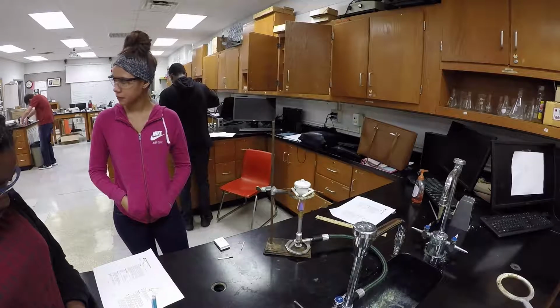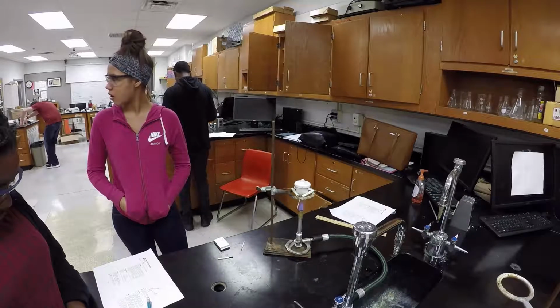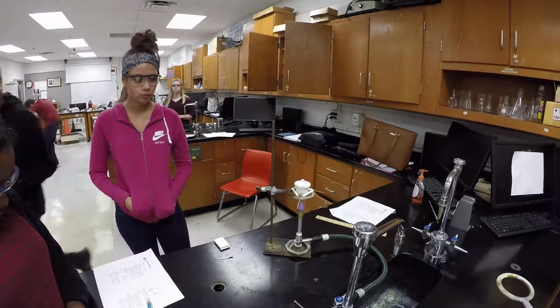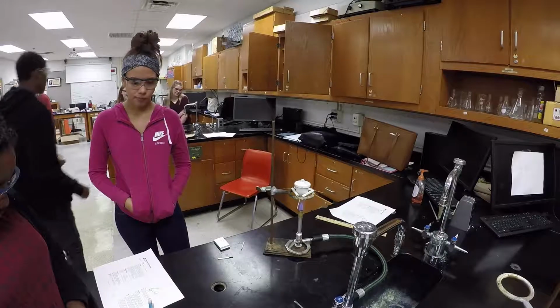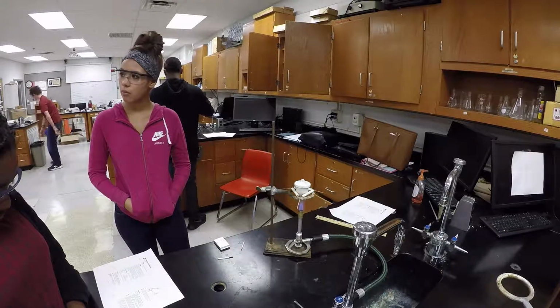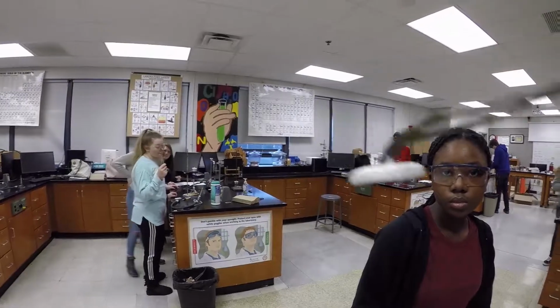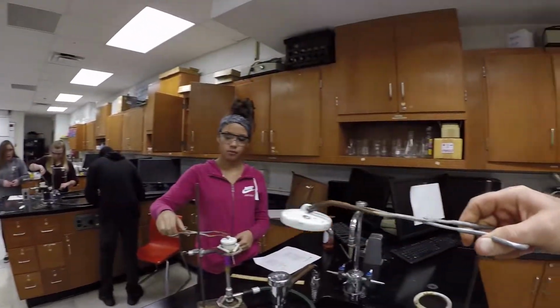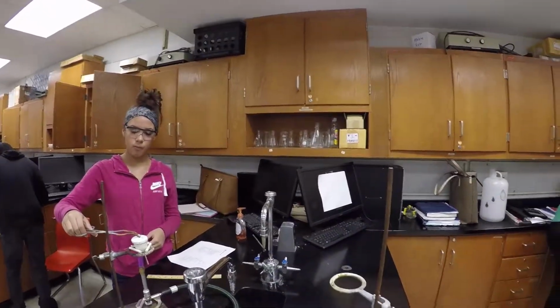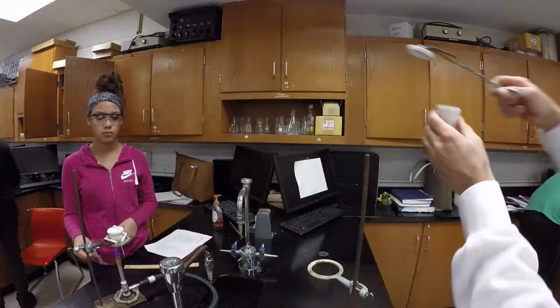You're going to put the magnesium in there after you measure it out. Well, they're already measured, so they're just like... Where's the stuff that's going to be burning? Yeah, I'm getting there. Alright, hold on. Let me get the crucible tongs. Crucible top, like this. Sit around. Put it on the top there. Like that. See how that works?